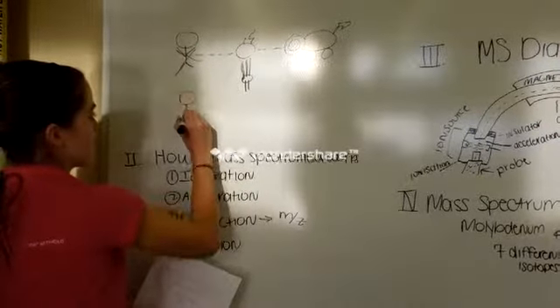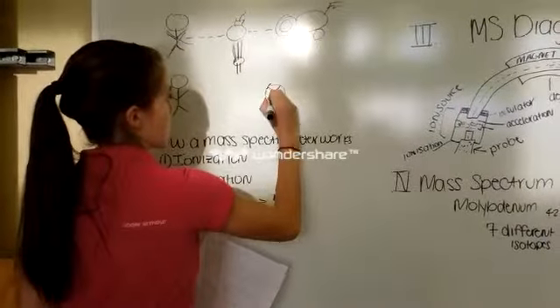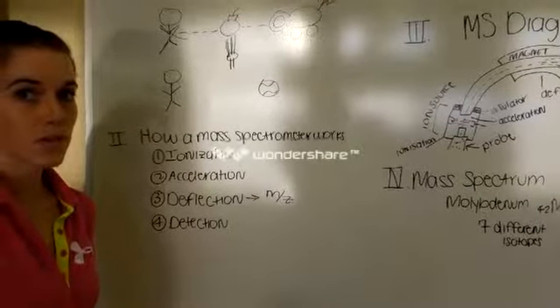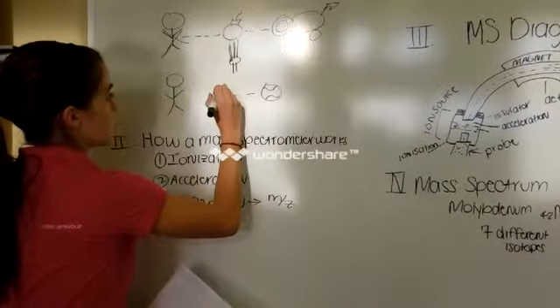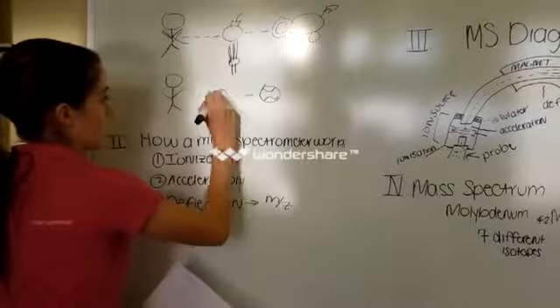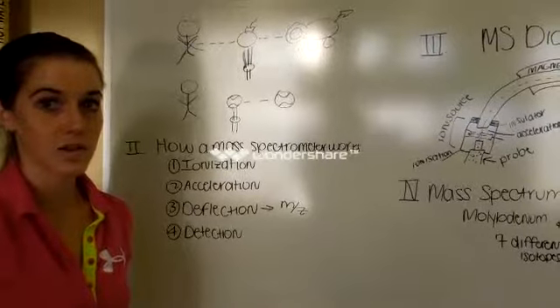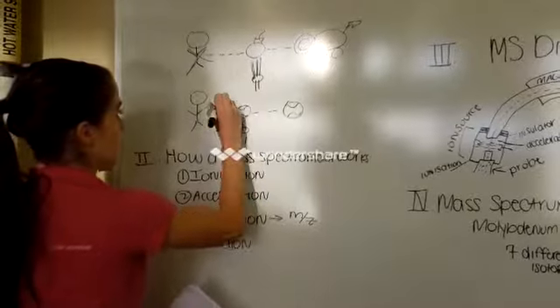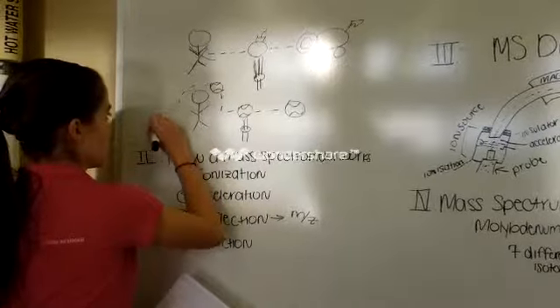Suppose instead you shot a tennis ball towards you. And this ball was moving at the same speed with the same force. And as I said before, all you had was the same jet of water to move it out of its path and be deflected around you. Now, the tennis ball is much, much lighter than a cannonball. So most likely this strong jet of water would be able to move it out of your path and not hit you.